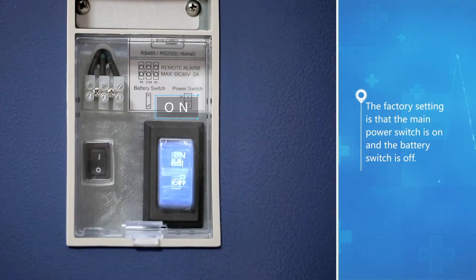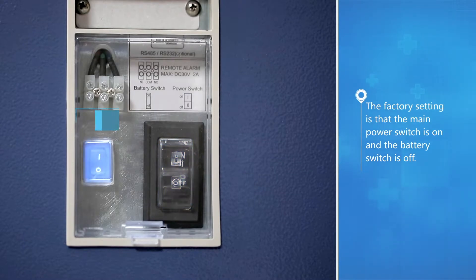The factory setting is that the main power switch is on and the battery switch is off.